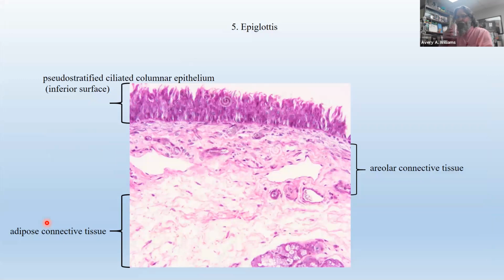More of the epiglottis. Here, this is a better shot. I'm thinking, well, I don't know if it's better. It's different. How about that? It's the epiglottis, but it's showing you the epithelial tissue right here on this bracket. It might be kind of a challenge to you to say, what? That doesn't look like a textbook example of pseudostratified ciliated columnar epithelium, PCC. It doesn't really, but it looks terrible. Look at that. But sometimes you gotta think. You gotta use your brain and figure it out based on what it could be.